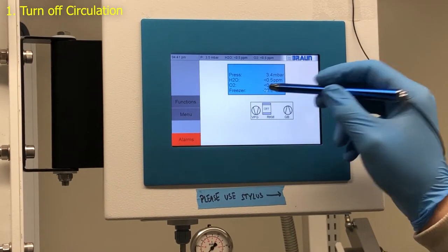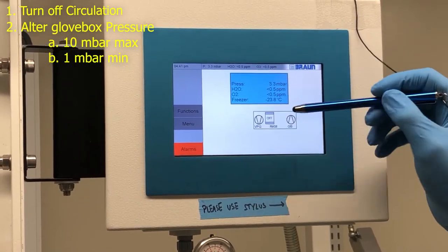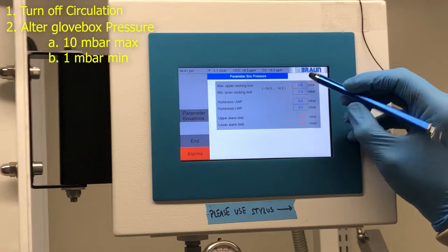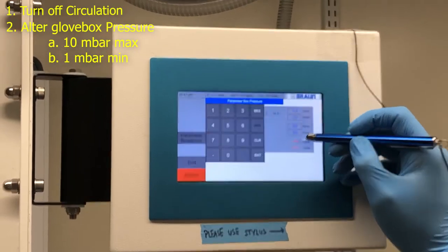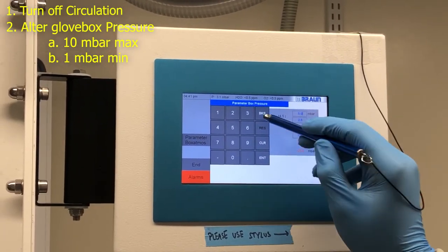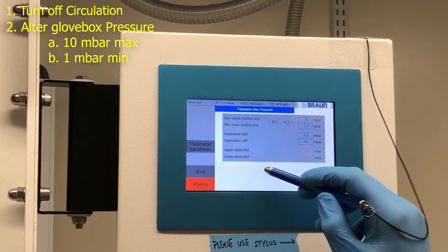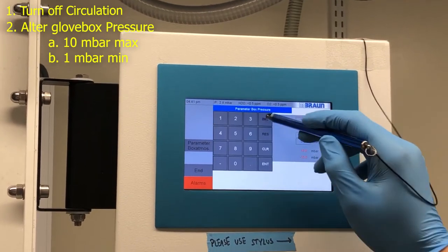Then you're going to go ahead and alter the glovebox pressure. You go to the menu, and you can alter from here. Our upper limit is going to be 10 millibar. So you want to go ahead and just enter 10. And our lower limit is going to be 1.